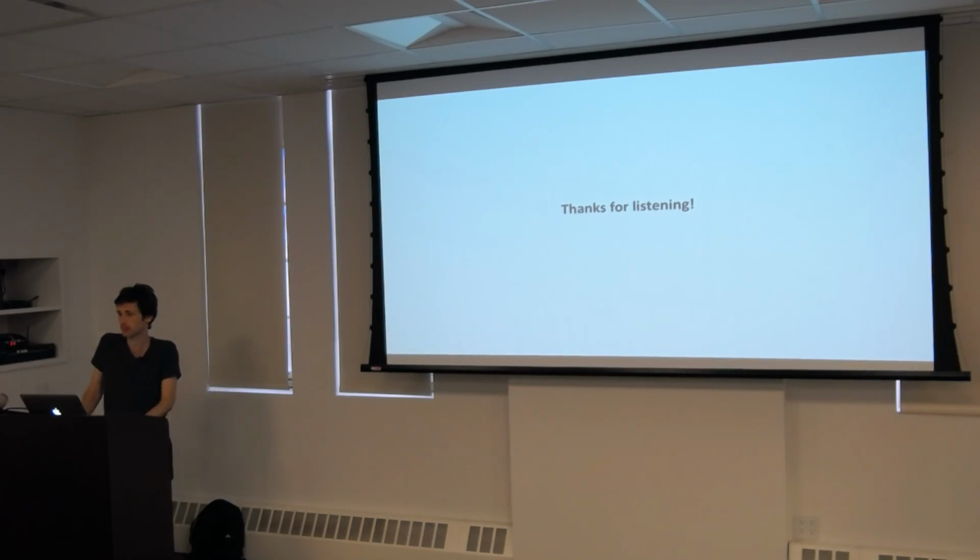Do you have a program you prefer for local refining? You didn't mention any program you're using. Oh, I was using Relion. Relion, yeah, but I'm sure you can do it with FreeAlign as well. I just don't have as much experience with that. CryoSPARC, unfortunately, can't do it yet. I really like CryoSPARC for a lot of things, but for local refinement, it doesn't work. In fact, for mask refinement in general, CryoSPARC isn't really great. It's great for getting an initial map, but for local refinement, it doesn't quite work.